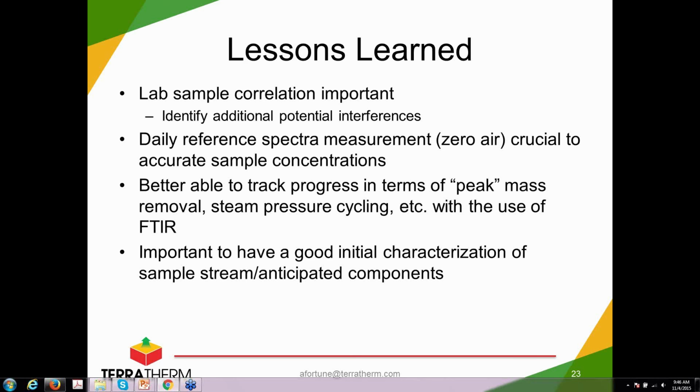And then as the mass recovery dropped off from those zones, we would have the ability to know that real time and potentially shut off heaters and shut off treatment in those areas which were done before other areas, so that we could save money on the overall cost of the project.